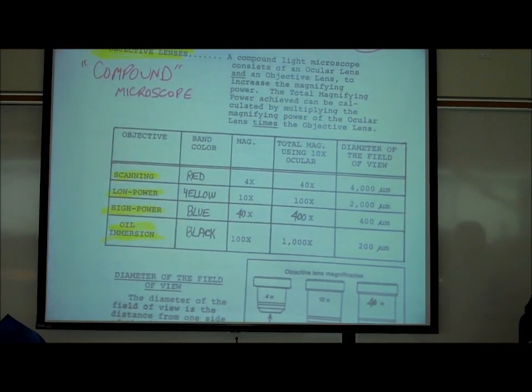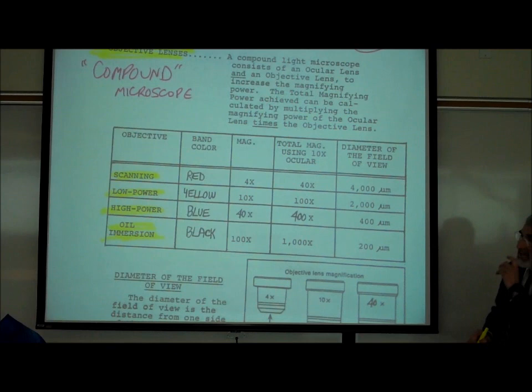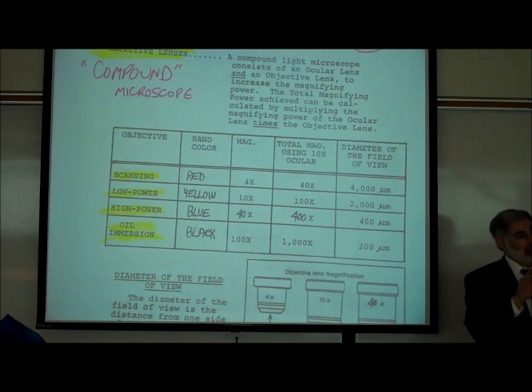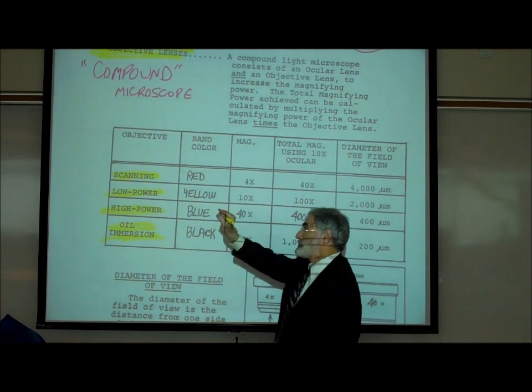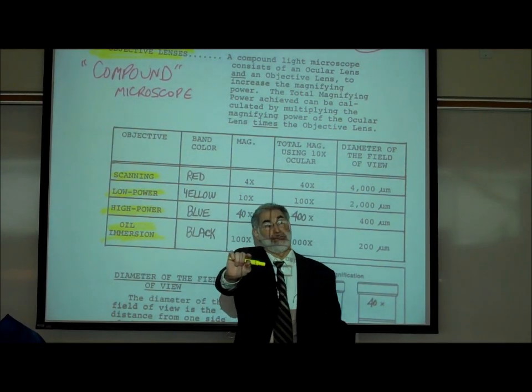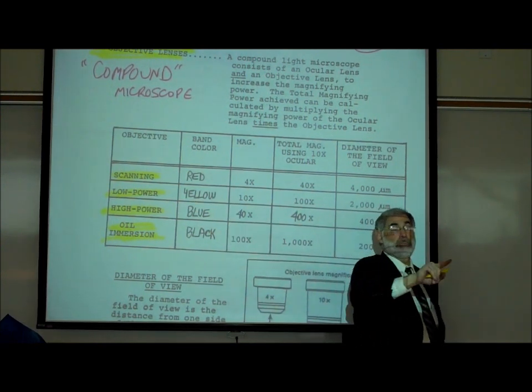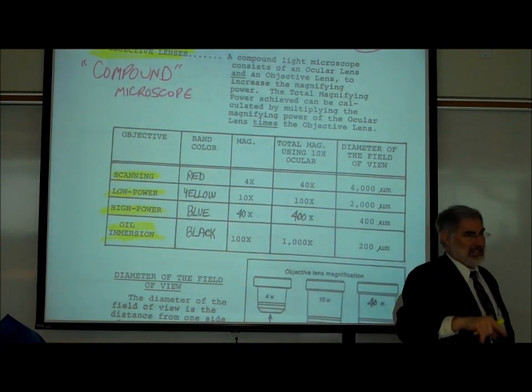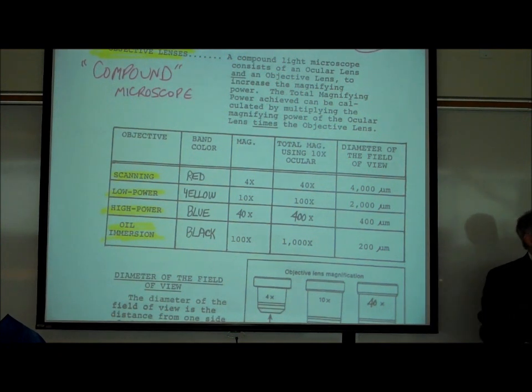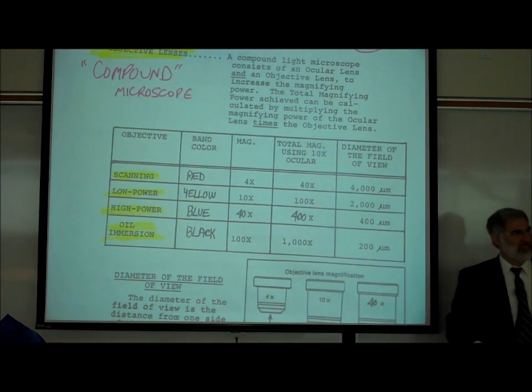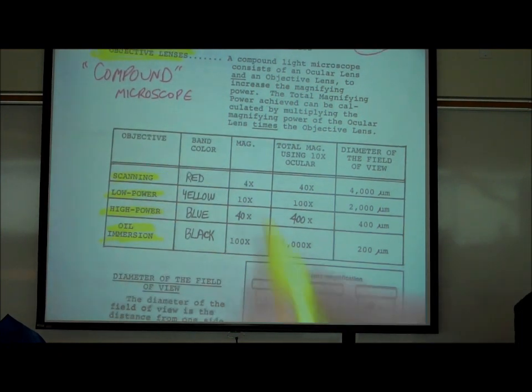We'd like you to know the magnifying power of each. The scanning lens is the shortest objective lens; it has the number 4 on it and magnifies four times.